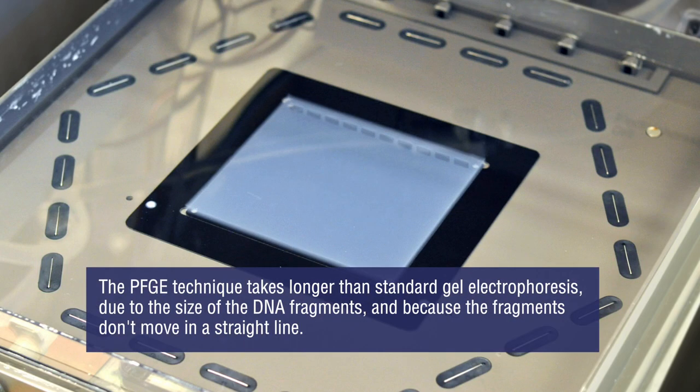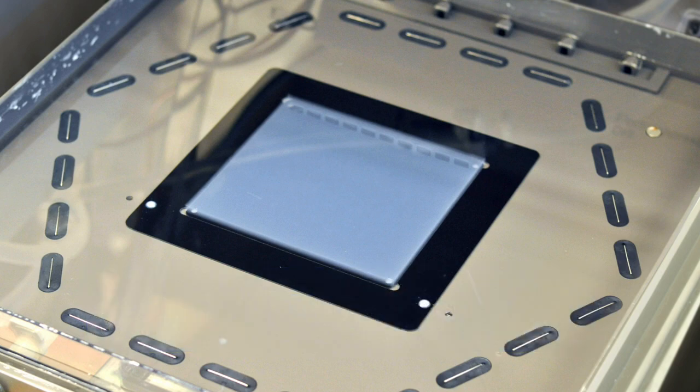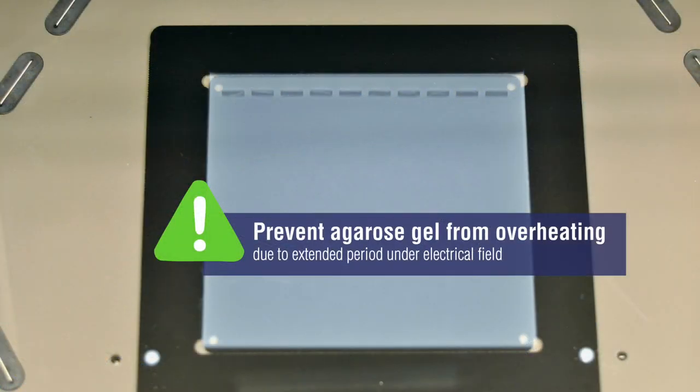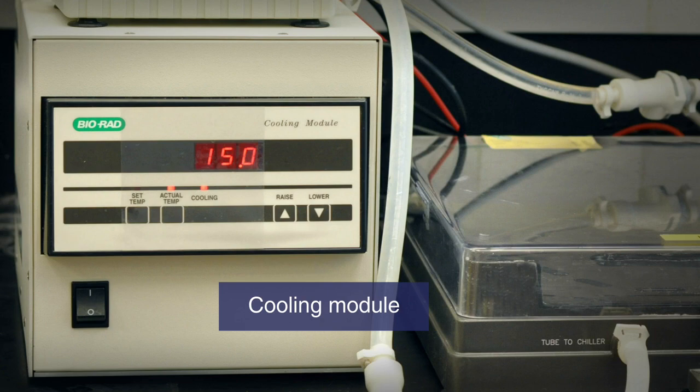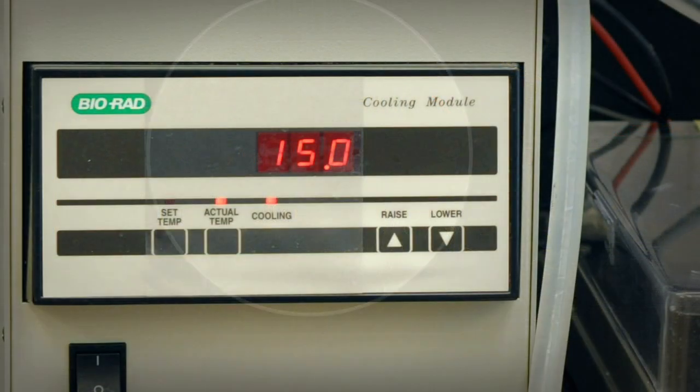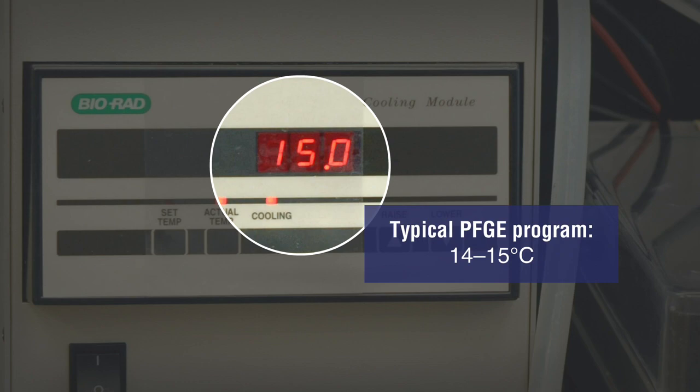The PFGE technique takes longer than standard gel electrophoresis due to the size of the DNA fragments and because the fragments don't move in a straight line. To prevent the agarose gel from overheating due to the extended period under the electrical field, which could result in a loss of resolution, a cooling module adjusts the temperature of the buffer. A typical PFGE program is run at 14 or 15 degrees Celsius.